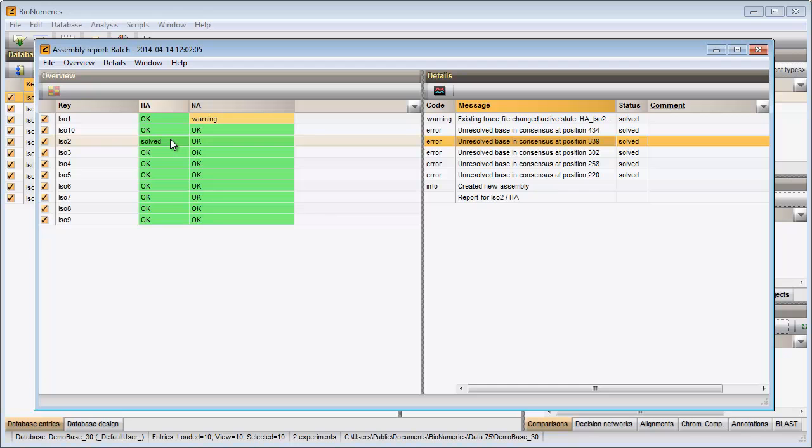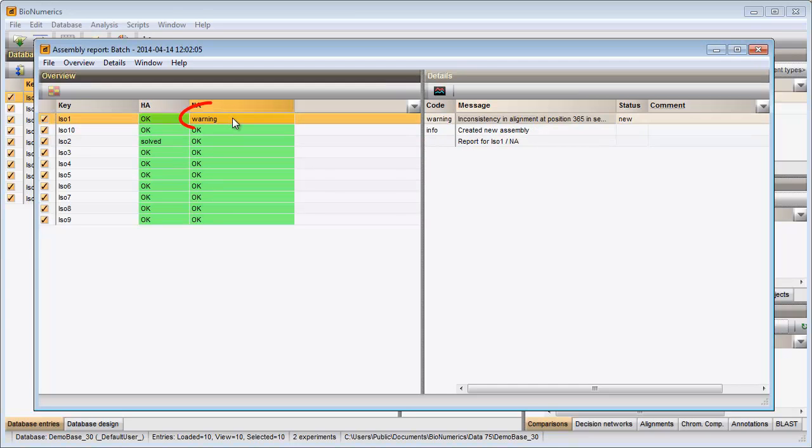The cell is updated and displayed in green. It is not required to check this assembly, but still it is recommended. I can open the assembly by double-clicking on the message.